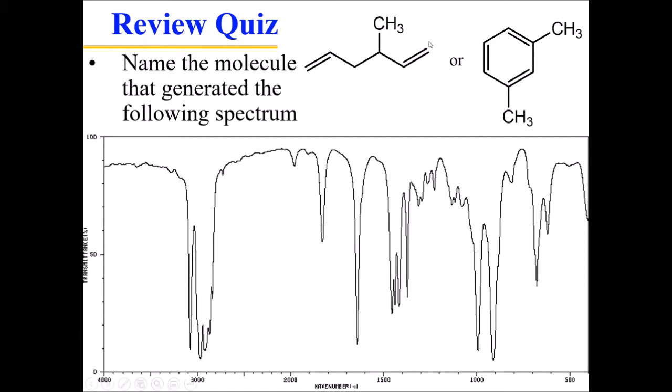In the same way, when a photon strikes these two hydrogens out here on the end, and they start to make that scissoring motion, opening and closing like that, they can absorb these photons down here at 900 and 1,000 by going to their first excited state, or they can absorb a wave number that's approximately twice the value. So 2 times 900 is 1,800, that one right there, and 2 times 1,000 is about 2,000, that one right there. That's where the two hydrogens start moving to a second energy level. That shows up from time to time. That's what we call an overtone, and you can think about it like an echo peak.